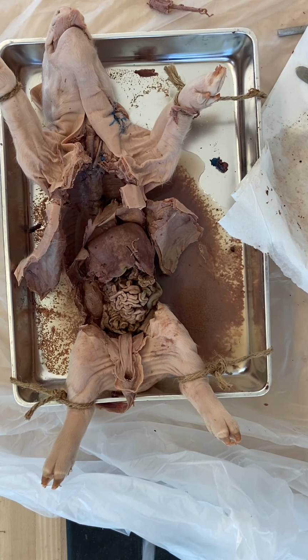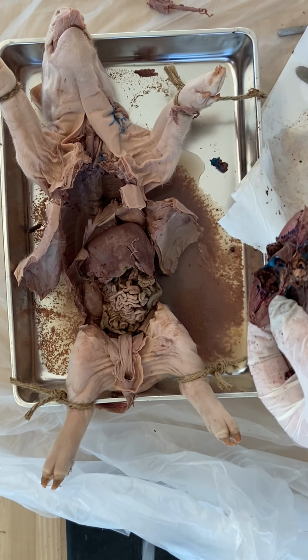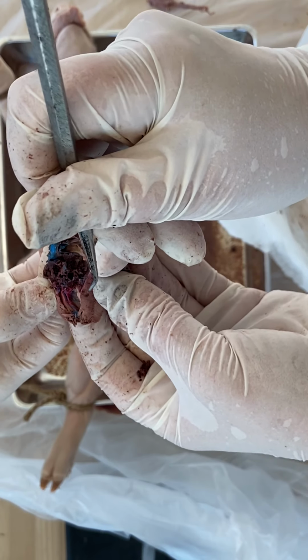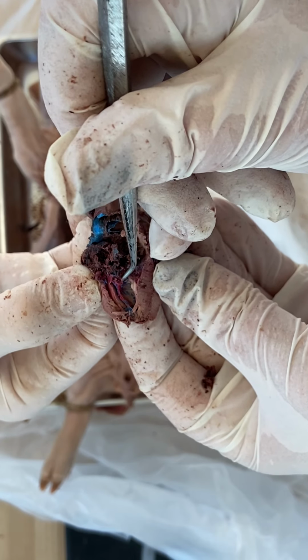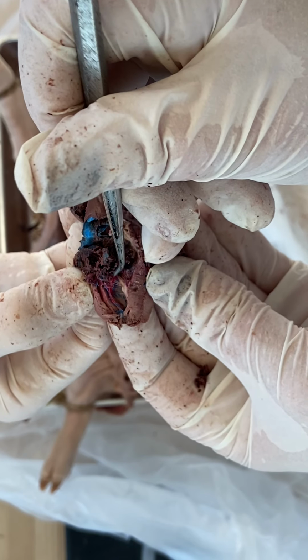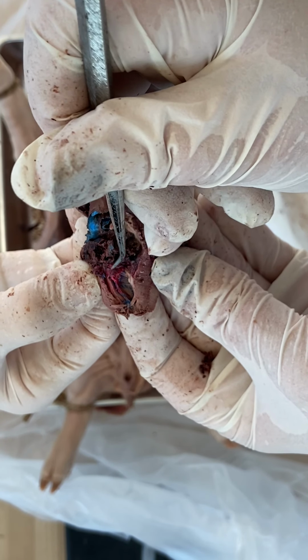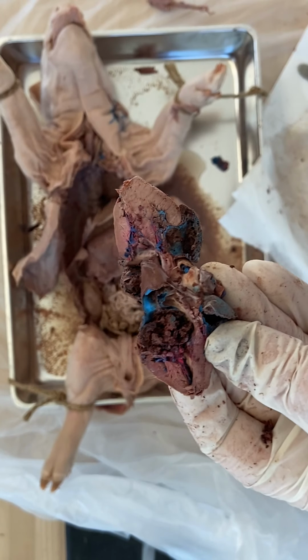It's hard to tell. Oh, there's some heartstrings. There we go. Oh, look at those. Now, you're really going to have to zoom in because even I can only just see them. Let's see how close we can get. All right, here. Those. I do hope you can see them because I can see them. Those are the strings that pull the valves between the right atrium and the right ventricle. And there they are. And that's where the term heartstrings comes from. So we could see them.